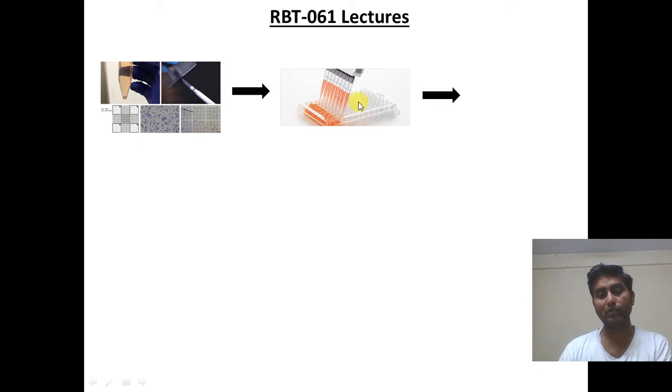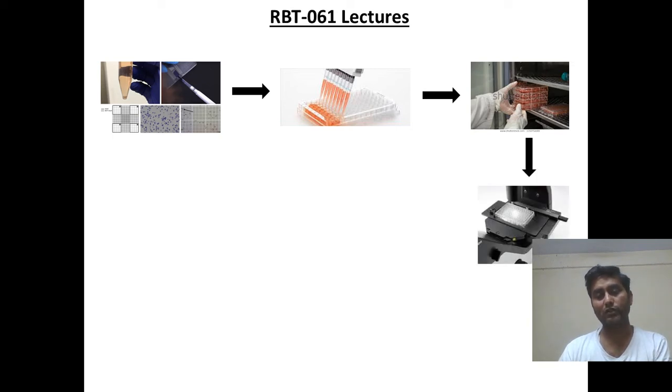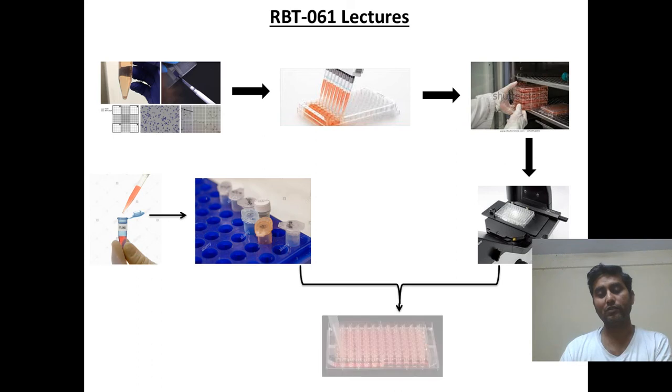After seeding, we'll keep this plate in an incubator at the incubation temperature and condition. Then on the next day, or after another day, we can check the confluency of the cells, and if the cells are ready for treatment, in parallel we can prepare the drug, diluting it to the desired concentrations we want to test, and then we'll go for the treatment of the drug in the seeded plate.